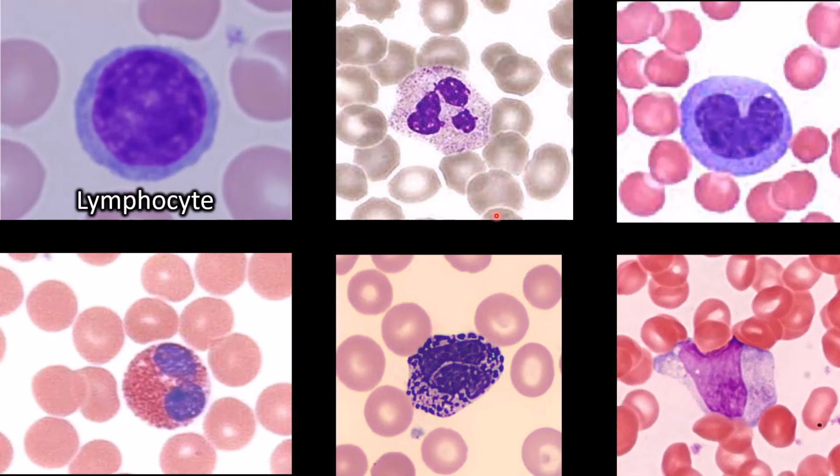Next door is the neutrophil because it has a multi-lobe nucleus and it has that grainy, kind of sandy appearance. Remember, you don't always see grains in neutrophils, but this one does happen to have a nice appearance of being grainy.